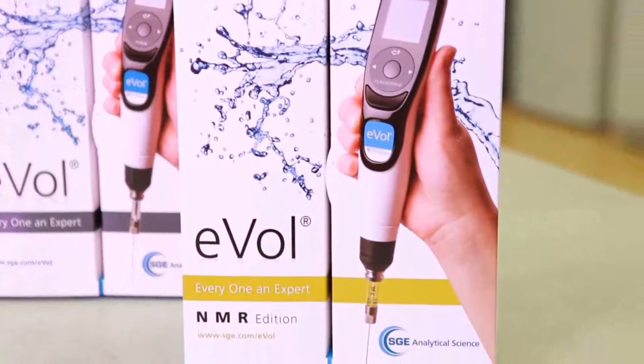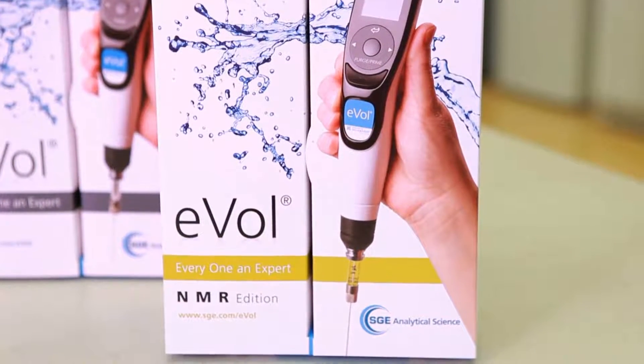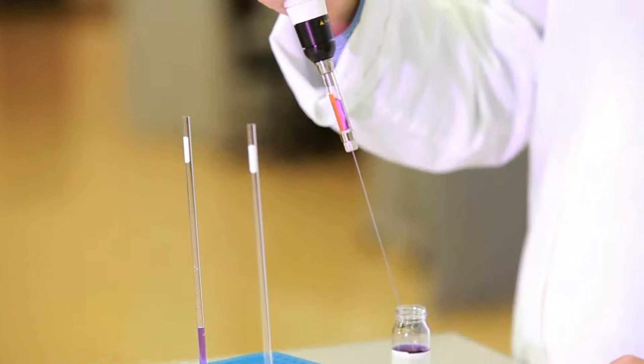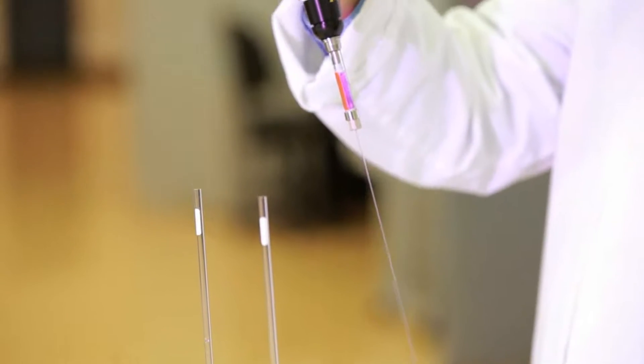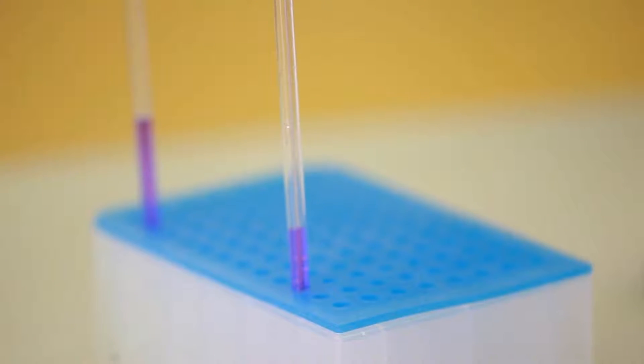Use the EVOL NMR Edition to further extend EVOL's capabilities. The NMR Edition kit features long stainless steel needles that enable in-tube sample dilution and mixing, and recovery of samples, facilitating reuse of NMR tubes.